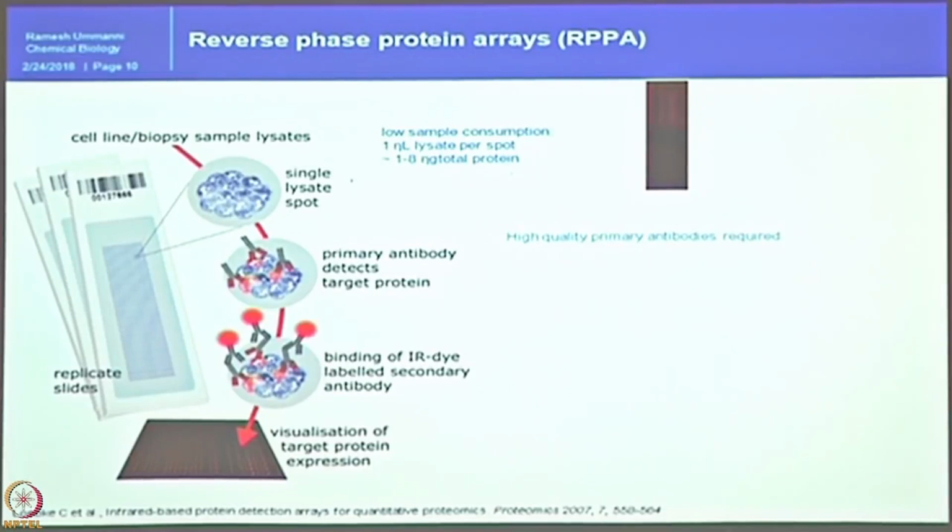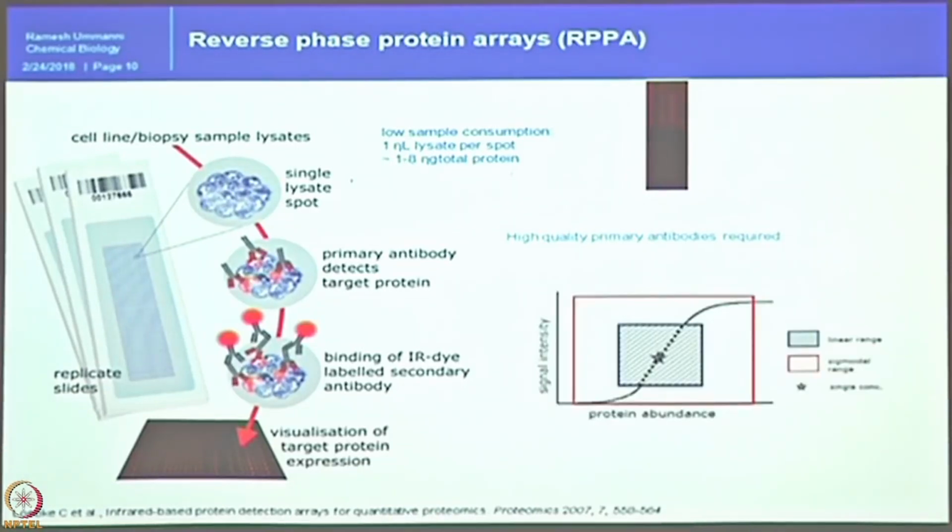That is where reverse phase protein array is difficult to perform in protein laboratories. So, there is a way, and also there are multiple detection methods available: alkaline phosphatase detection, HRP detection, chemiluminescence, and also infrared imaging, as well as cy-labeling and all. So, in our approach in our lab previously, we used infrared labeled secondary antibodies to visualize the primary antibody signals.